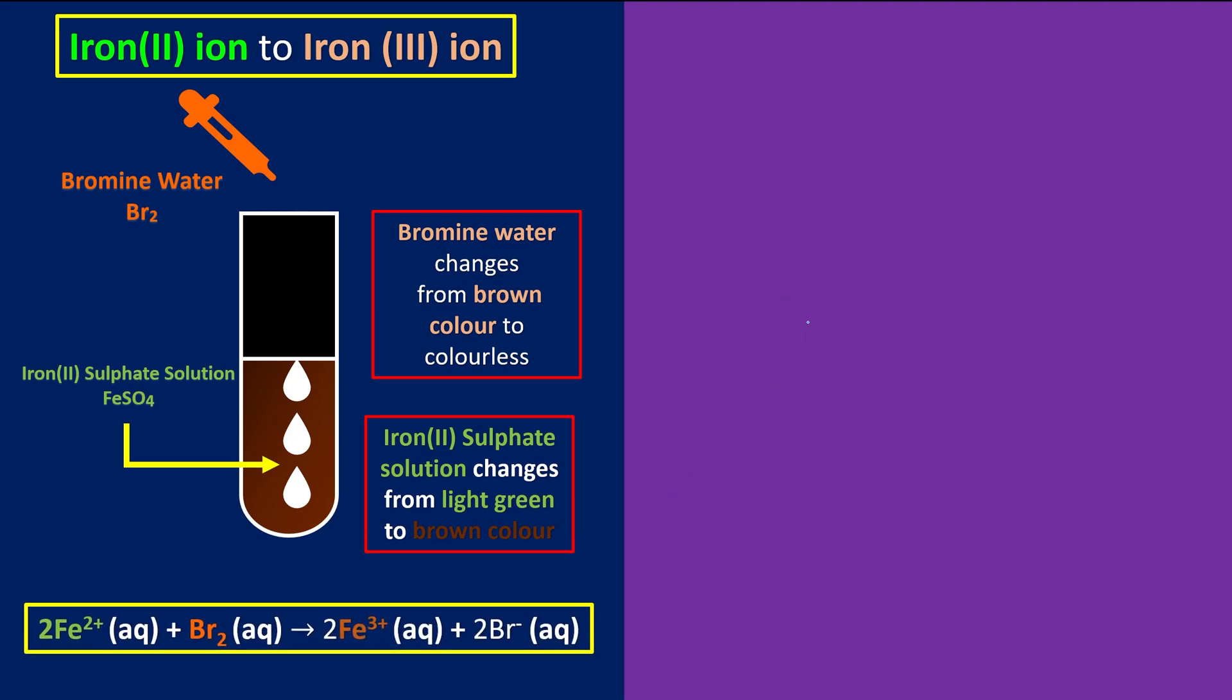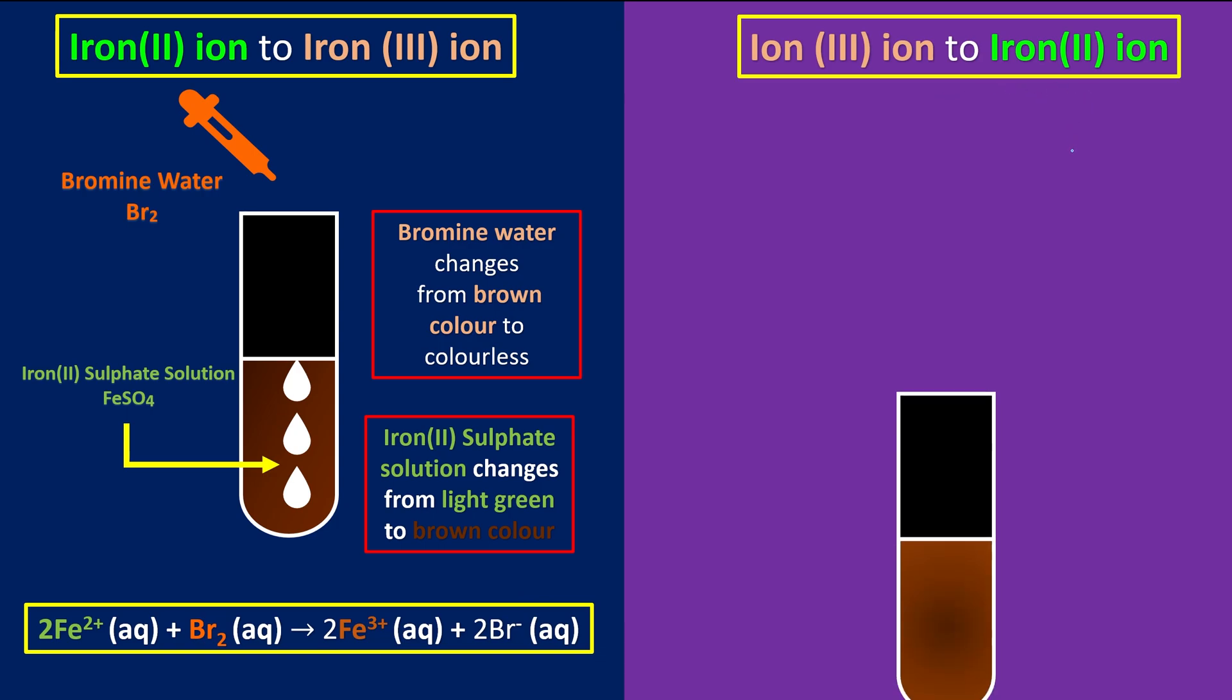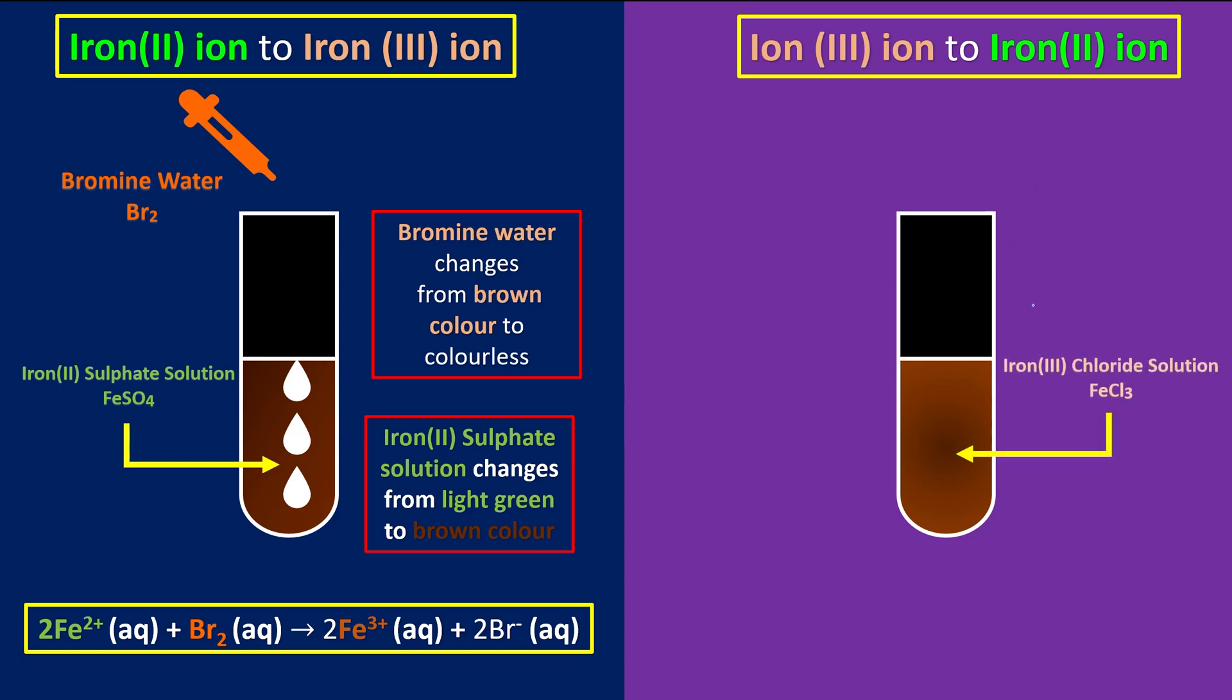Now we're going to look at how we're going to convert iron(III) ions to become iron(II) ions. First, we prepare a test tube that's filled with iron(III) chloride solution. As we can see here, now we have iron(III) ions. As we mentioned before, you need to receive the electrons so that it goes back to iron(II) ions.